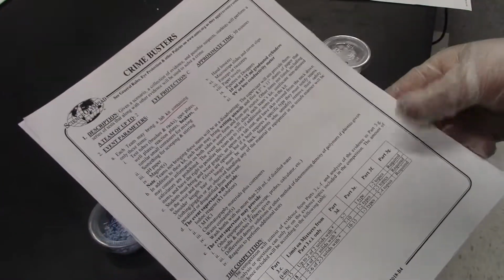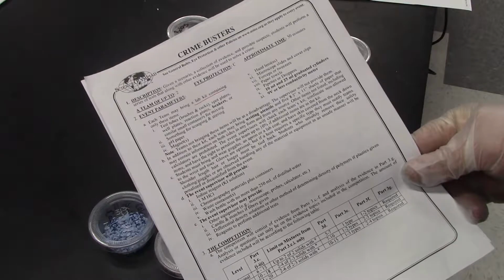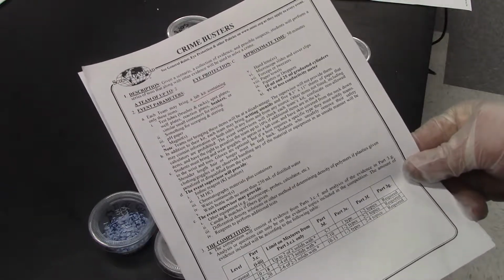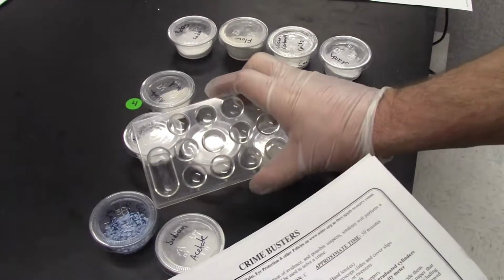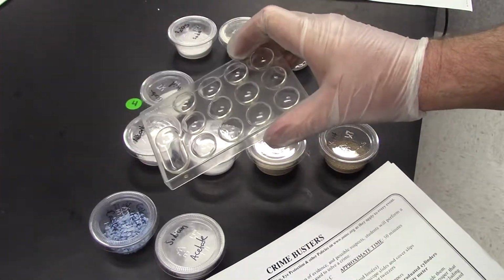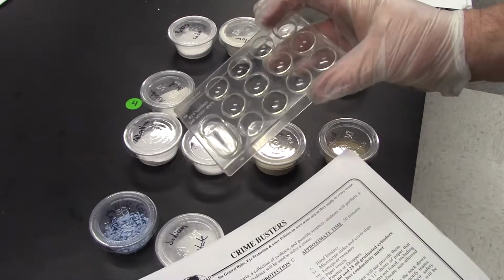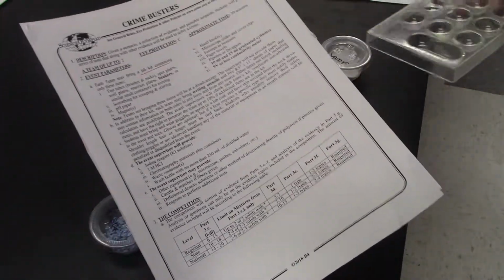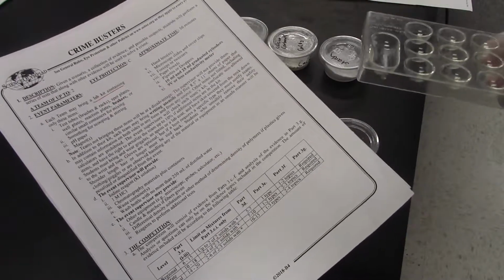If you look at some of the rules and specifically the kit, each team may bring test tube brushes for cleaning and spot plates, which look like this. This is the spot plate right here. The spot plates allow you to put small samples of your powders into the plate and carry out some basic tests. With 6 or 15 powders, you might want to just get good at writing down observations.